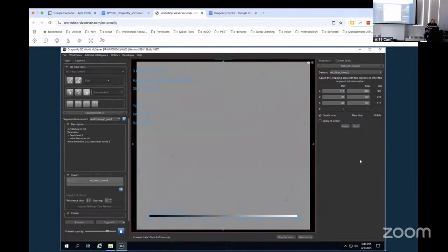And then I'm going to scroll up to the top of the signal. Actually, it's the very top of the tomogram. So you can just go, well, maybe it's not. Let me hold on. I take that back. Okay, so go from 46 to 78.